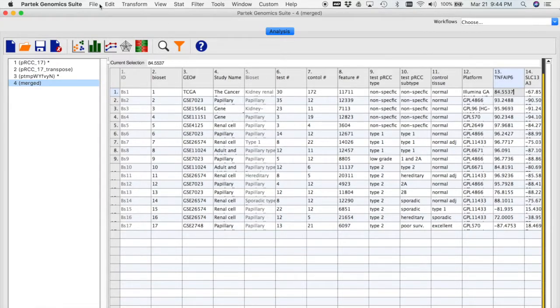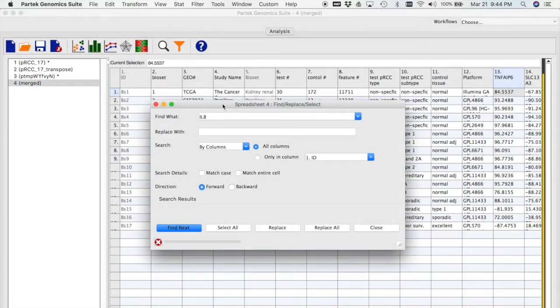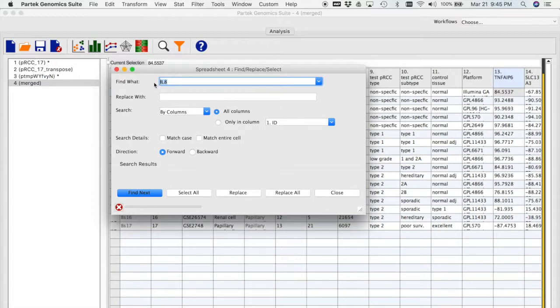I just go to Edit, Find and Replace. I want a question mark. And I'm going to replace that with all zeros.